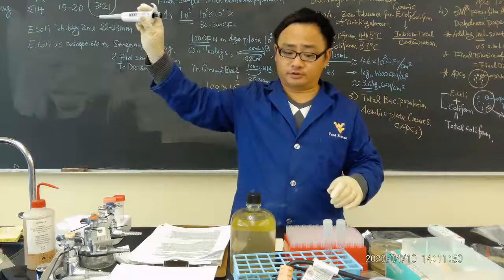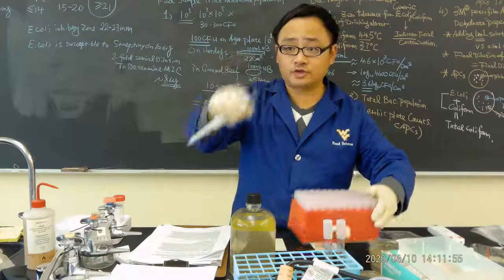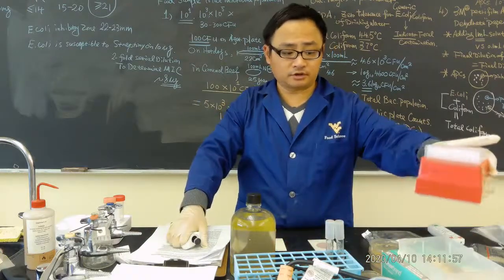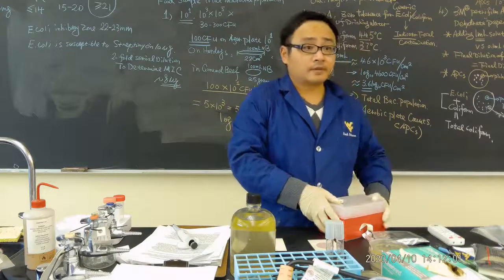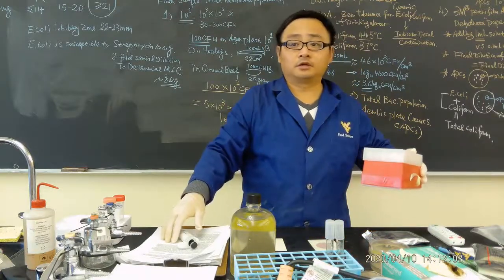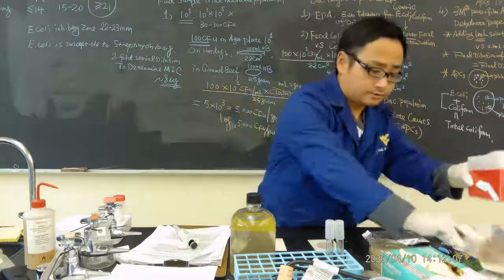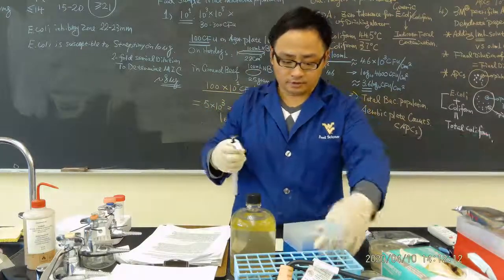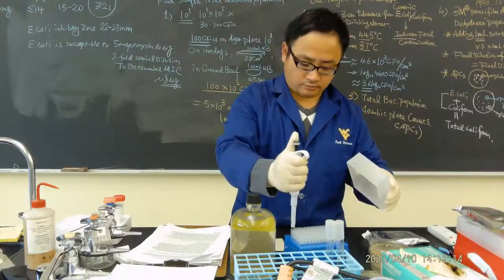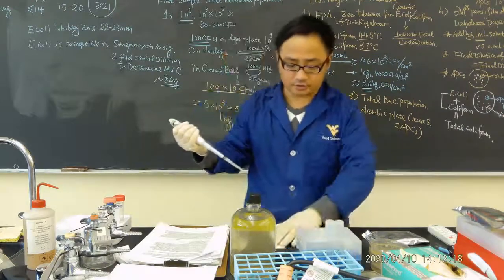That is very important, okay? So let's change the tips. Let's use those tips to see whether it works. Seems like this doesn't work. No, use the blue box. Yeah, use the blue box. I think that might work. Okay, let's see. Yeah, that works.